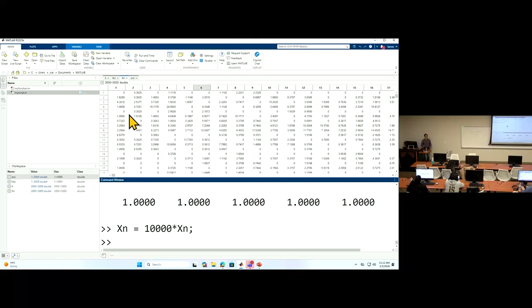Okay, so this is the normalized version. This is a normalized version of that expression matrix by library size.